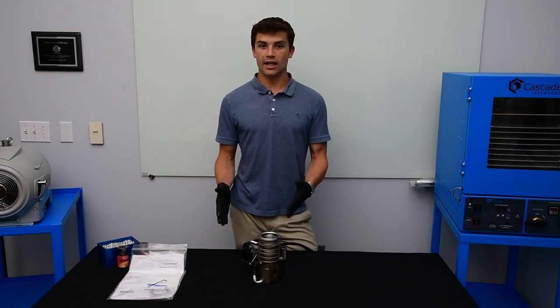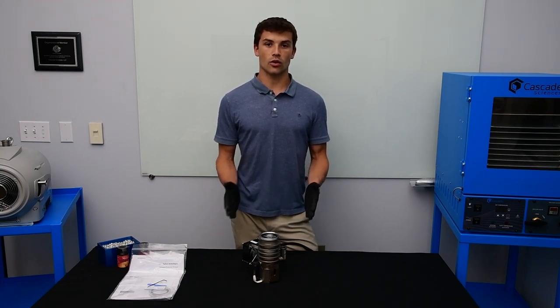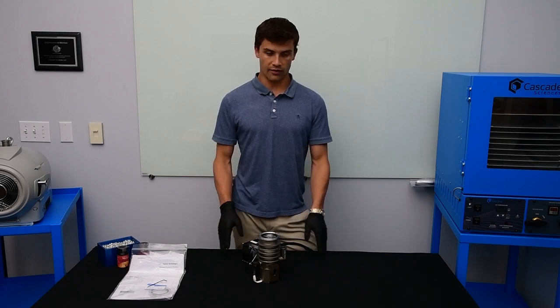For example, the IDP7 will give you about two and a half liters per second of pumping speed, and this AX65 gives you 65 liters per second of pumping speed when you're in the high vacuum region. It is still necessary to back the pump with a vane or scroll pump when you're in high vacuum.